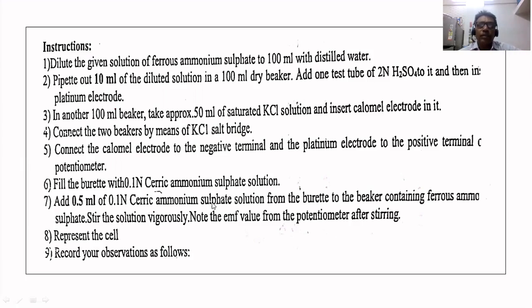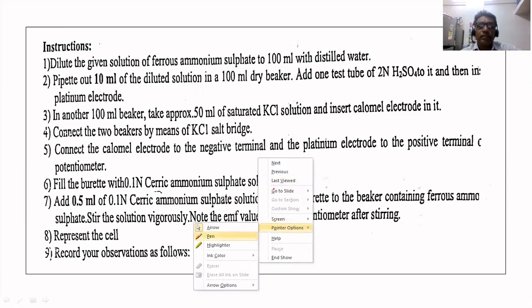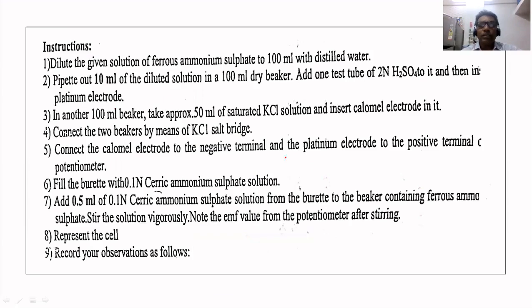So a chemical reaction takes place between these two reactants. In the beaker we have taken Fe-second solution. The Fe2+ reacts with ceric ammonium sulphate, that is, the cerium tetrapositive ion, and oxidation of the ferrous ion takes place.